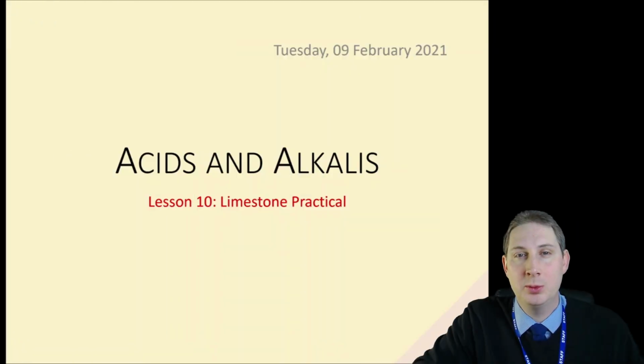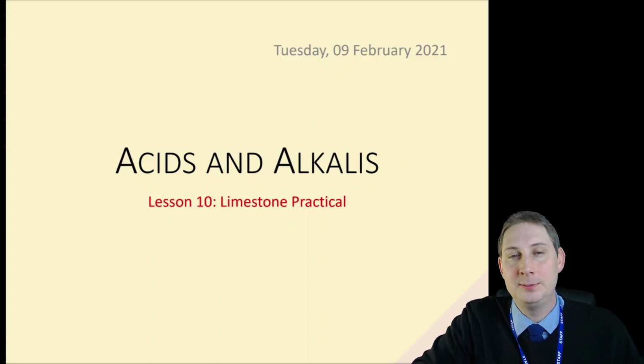Morning Year 8 and welcome to the third and final part of your limestone practical. By now you should have planned your method and been given the opportunity to adapt and improve your method so you can say how you would have carried out this practical, investigating the amount of limestone in different samples of rock. There were some very good methods, there were some that may have worked given a few more details, and there are some that I don't think would have worked. Nevertheless, I remind you the whole point of this was that you got the chance to plan your own experiment.